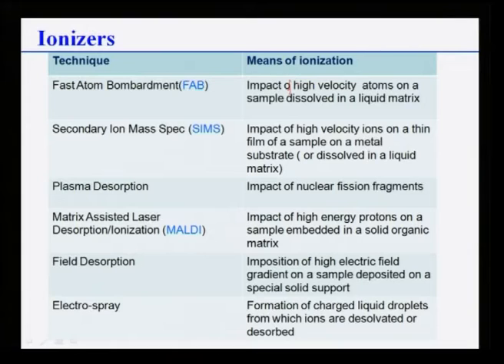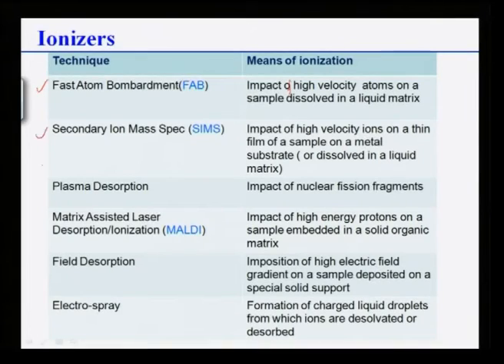Then you can always have plasma desorption. This is nothing but impact of nuclear fission fragments. Nuclear fission fragments are always, you know, like alpha particles, gamma particles, or beta particles. These fission fragments can lead to plasma desorption. We can also have a technique known as matrix assisted laser desorption and ionization, which is known as MALDI.